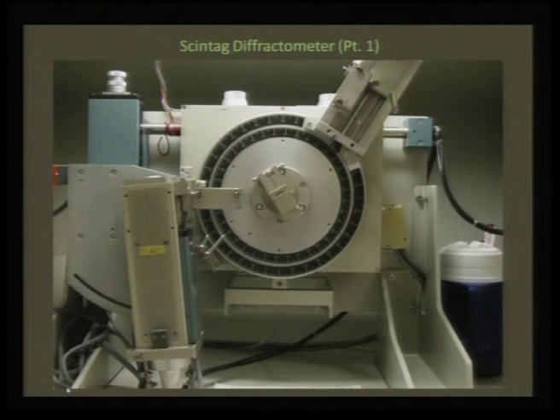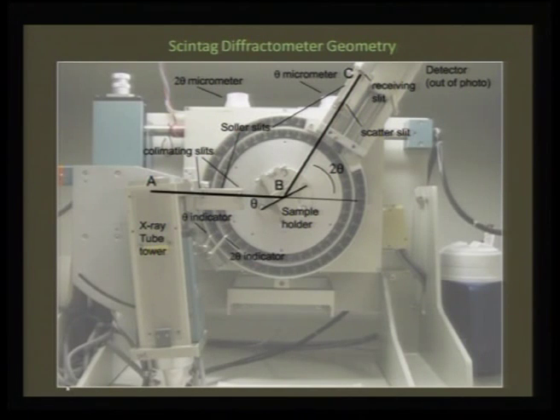Typically, a diffractometer looks like this. This is one of the older versions of the diffractometers. There are more than 6 companies which are producing such X-ray diffractometers. This is just to give you an idea how involved this procedure can be, and I will also show some of the other, present generation ones which are much simpler, but with different facilities available in a single diffractometer. As you see here, this is your X-ray tube tower through which X-ray is produced, and your sample holder is mounted here, and then you have the receiving slit and your detector, and this is all connected to the X-ray recorder.